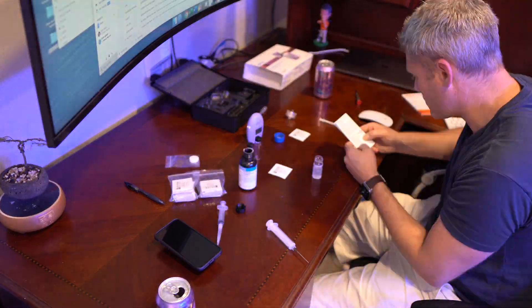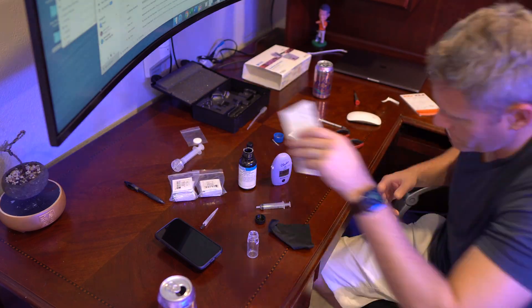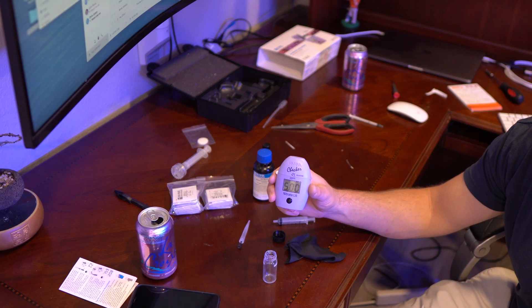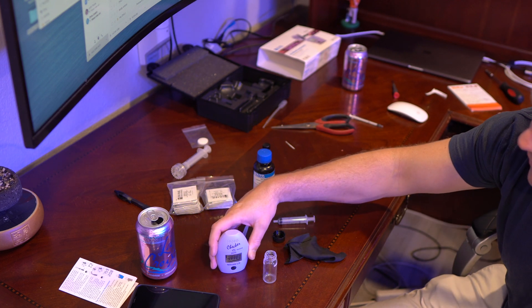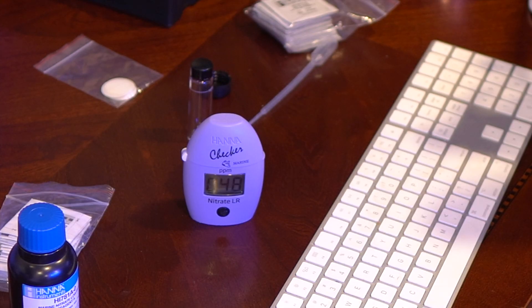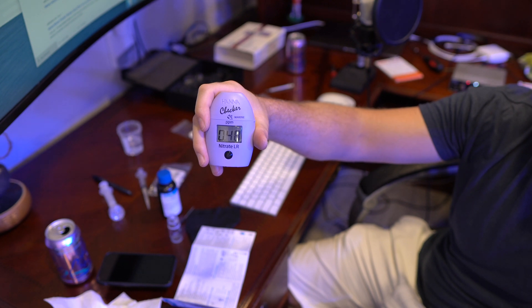With the HANA checker, you can test 0 to 5 parts per million and 5 to 50 parts per million. Since I got a 5 with the NIO test kit, I first ran it for 0 to 5 and got a blinking 5. If it's blinking, that means that you're over 5 parts per million. So I redid the test with the 5 to 50 method and I got 0.48, which means 4.8 parts per million.